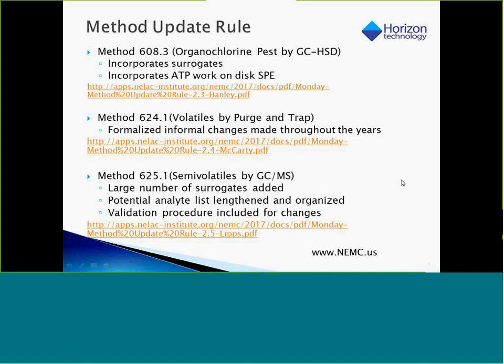So what changed in these methods? Well, I'll give you just a brief overview. Method 608.3 incorporates surrogates and incorporates some ATP work that was done on disk SPE in 1995. So there's 20-something years of data out there using solid phase extraction for Method 608, and it is now codified within the method.